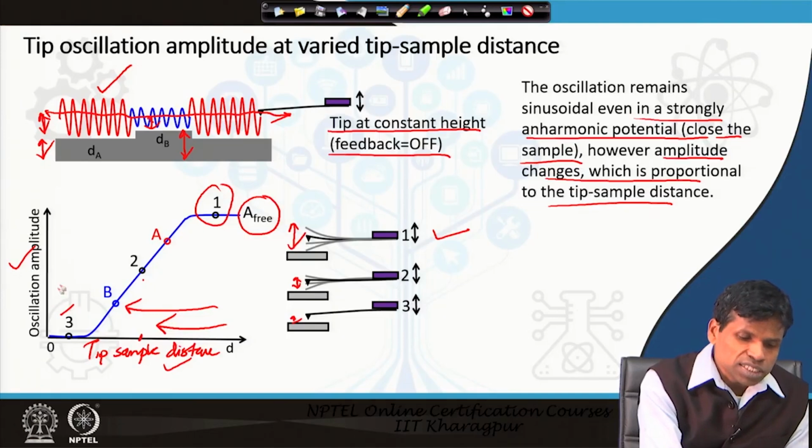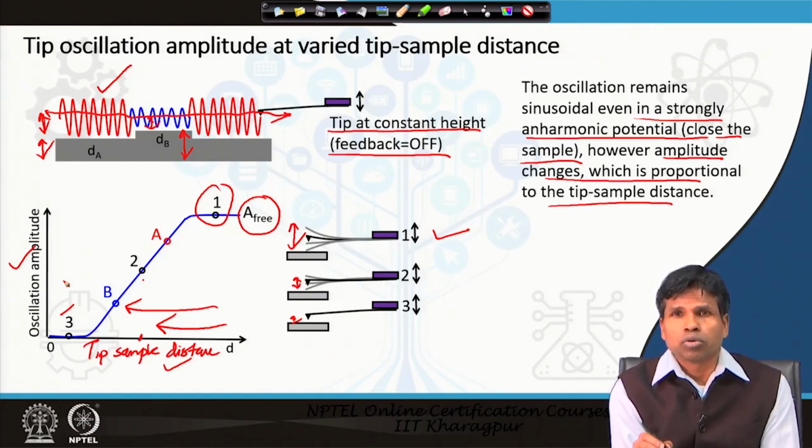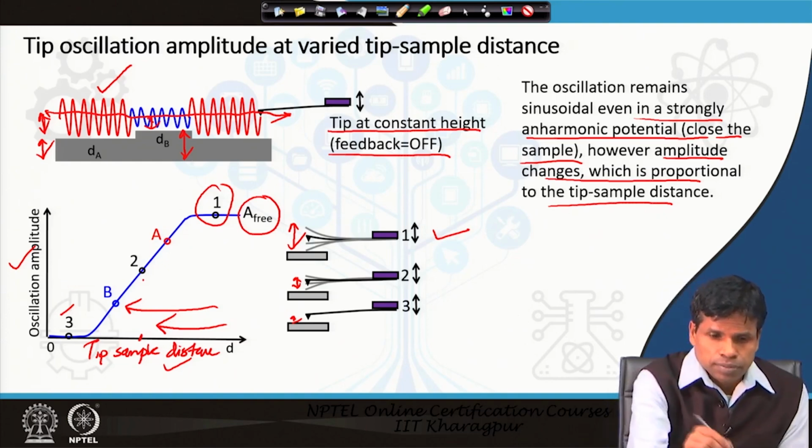So, by measuring this amplitude, we can measure the tip sample distance, and therefore, with that we can create a 3D imaging of the sample surface.